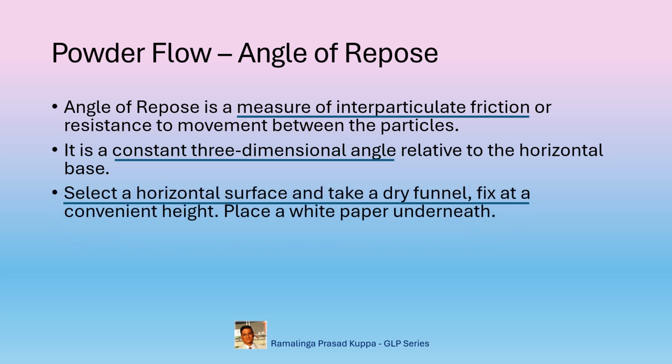Select a horizontal surface and take a dry funnel, fix it at a convenient height, and place a white paper underneath. The funnel used should be smooth and allow free flowing of the material through the funnel without any obstruction. It is also important that the funnel is totally dry. The funnel can be fixed firmly at 2 to 4 centimeters from the base.